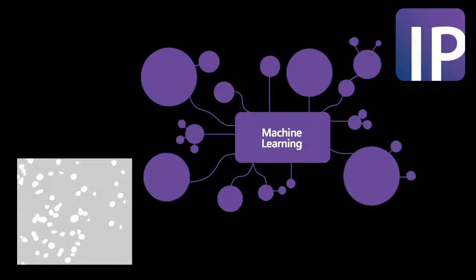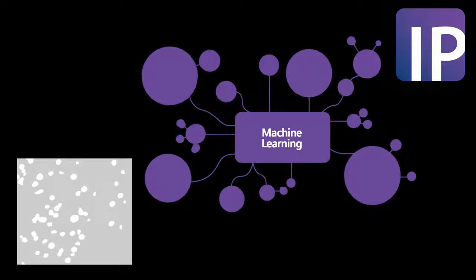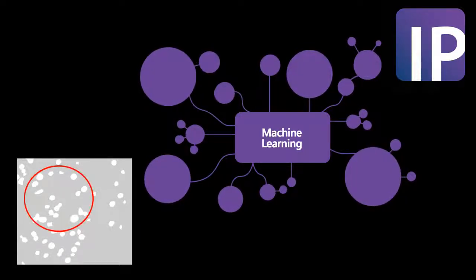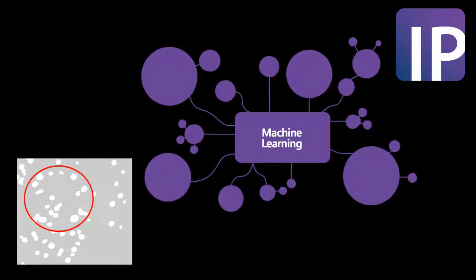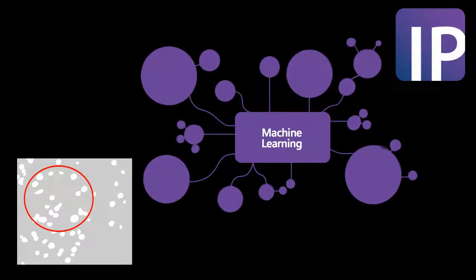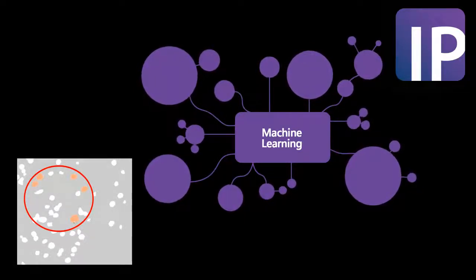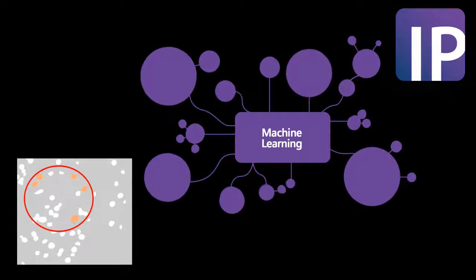In some instances, structures may be difficult to isolate due to little differentiation between the objects of interest and the background of the sample. To further assist in targeting specific structures of interest within the sample, users can limit the scope of the analysis by targeting objects of interest using one or many regions of interest. This can assist in providing a specific location for Smart Segmentation to focus on during the first few stages.